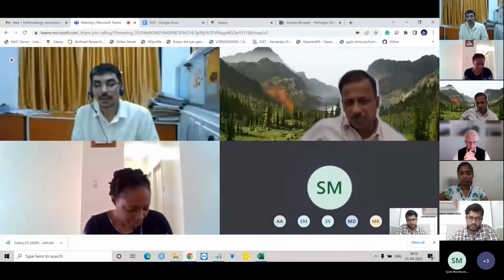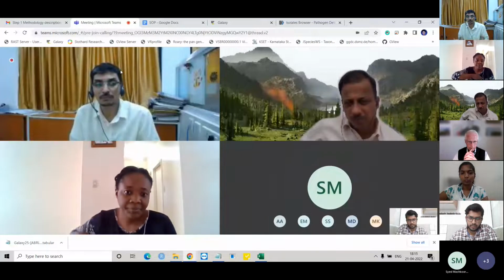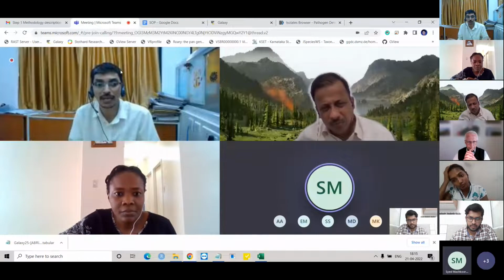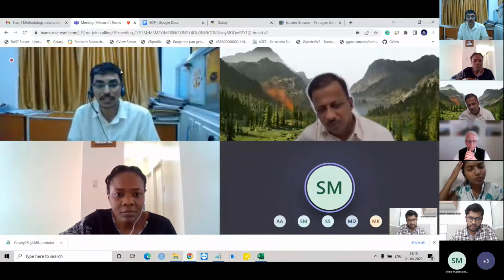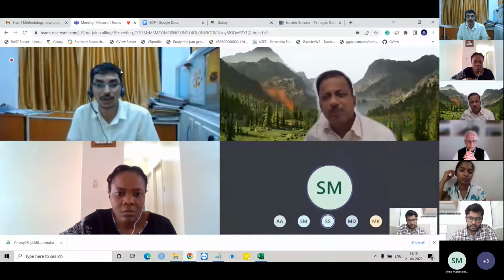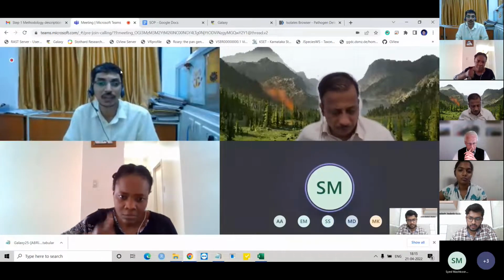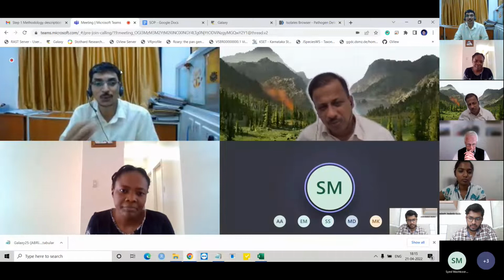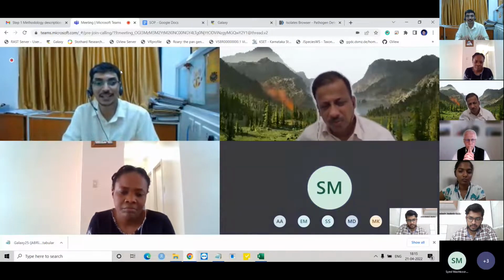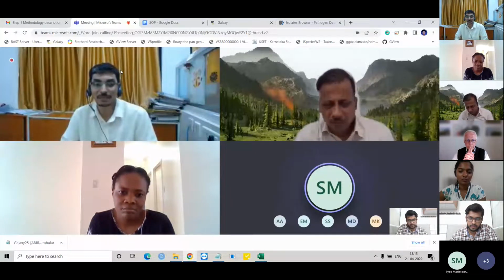Another option: if you're facing a problem with uploading these 4,000 data sets, you can split the data into 2 or 3 parts, each having around 1,000, so that you have 3 to 4 files. Upload each file individually, do the analysis, get the result, delete the data sets already there in Galaxy, and upload the fresh one. So that can be done.